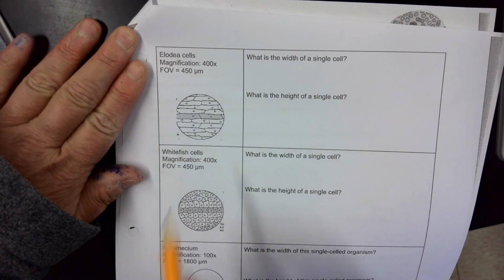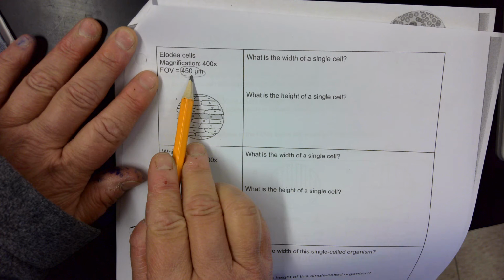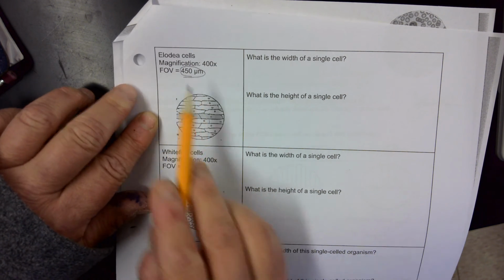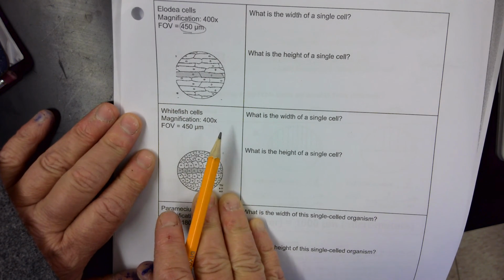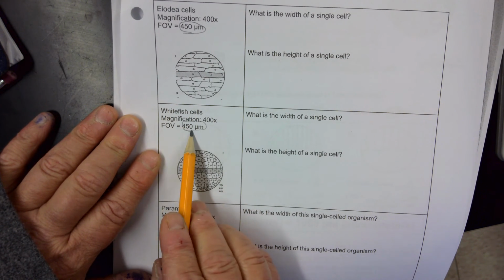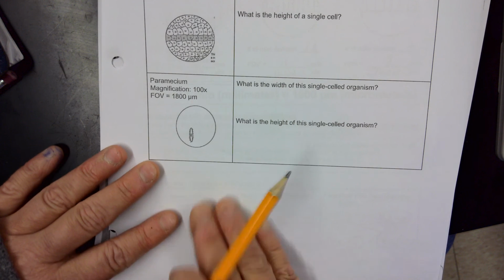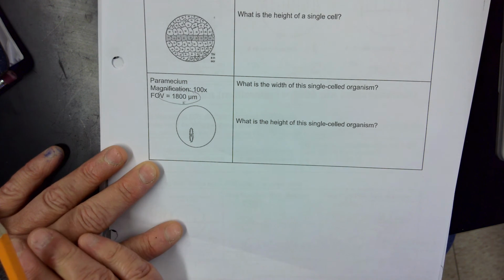Okay. All right, let's take a look at the examples on the back and show you a couple things that are a little goofy. All right, so just pay attention to the field of view, right? We're giving you what the field of view is for that particular magnification. So that should be pretty straightforward. Field of view here, 450, so that should be pretty straightforward. But then let's take a look at this example right here. We've got a field of view that's different, so pay attention to that field of view there.